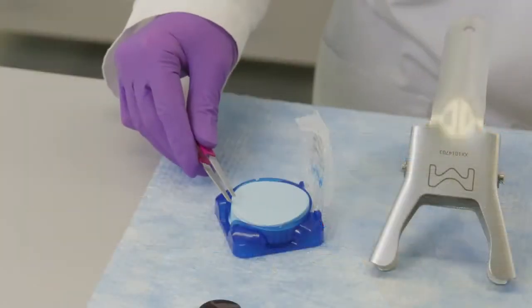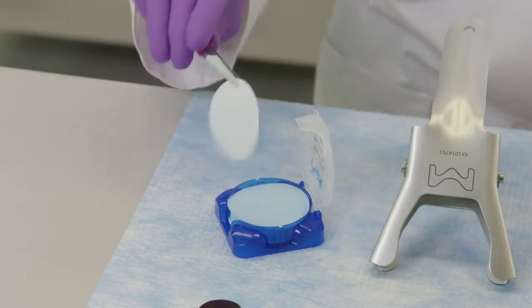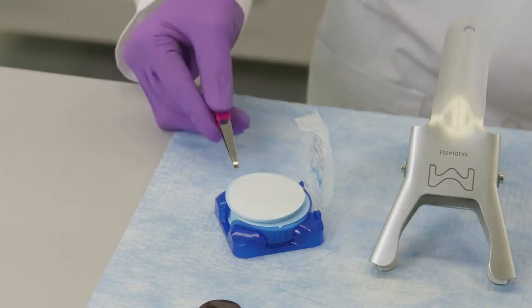Hello, my name is Danielle, and today I would like to help you differentiate between the blue and white cut disks in a package of Millipore Sigma's cut disk membrane filters.